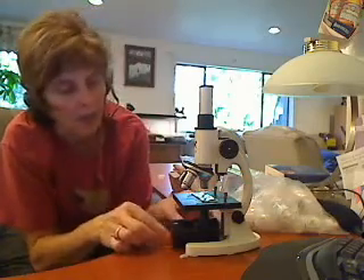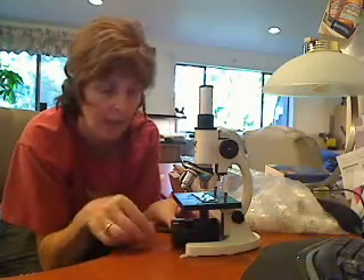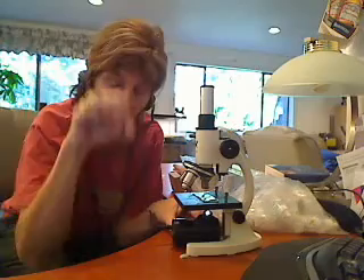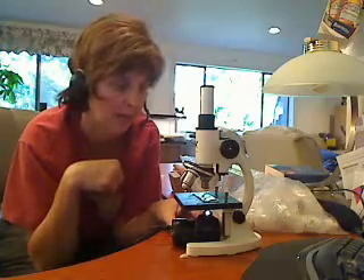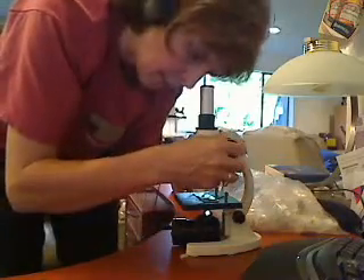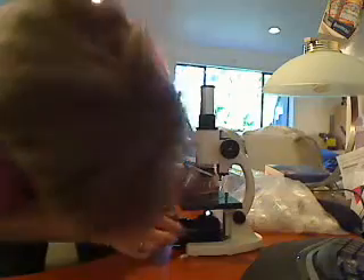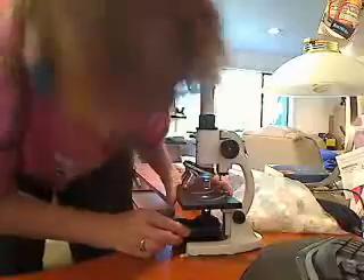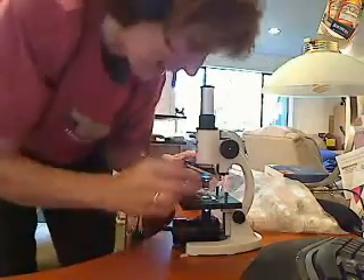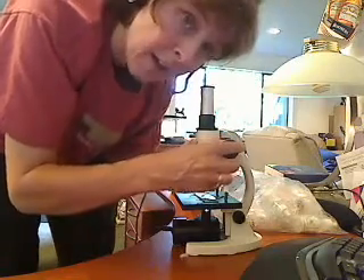This microscope had a mirror, but I plugged in the light — plugged this little power cord in — so we have light now. It's actually a pretty great little microscope. You're going to start by looking through, and just go up and down on the focus until you see your cells.